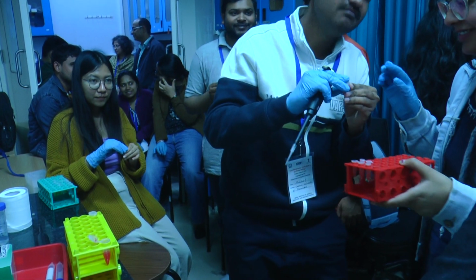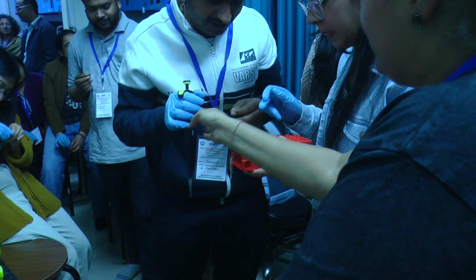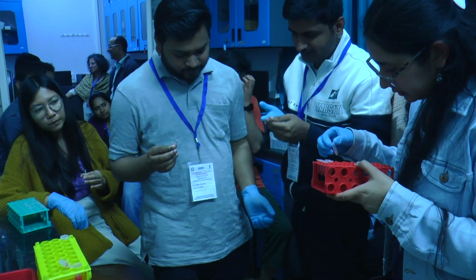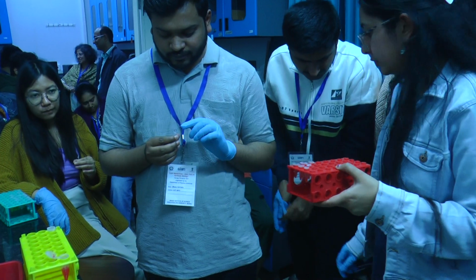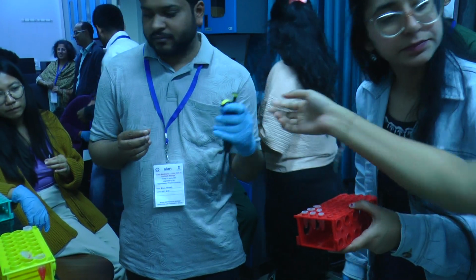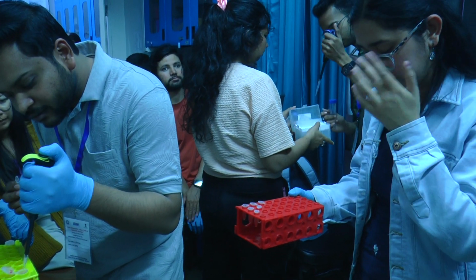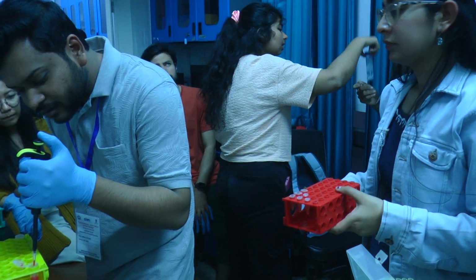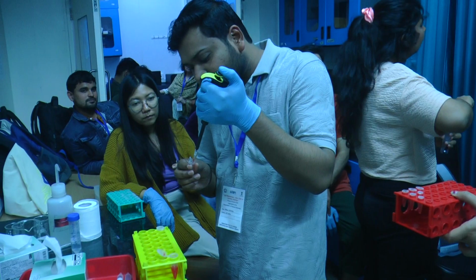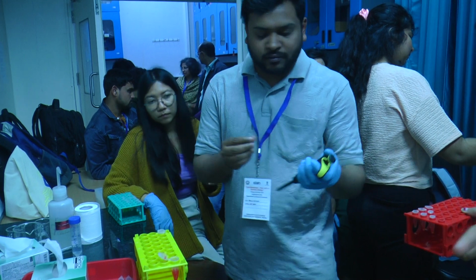It's okay. What we are doing is we are checking. We'll see. I think this is 3, right? 2 or 3? 3. Okay. Give it a name. Who is doing? So clean. I'll clean it. Yes, 100 microliters. Discard the tip.